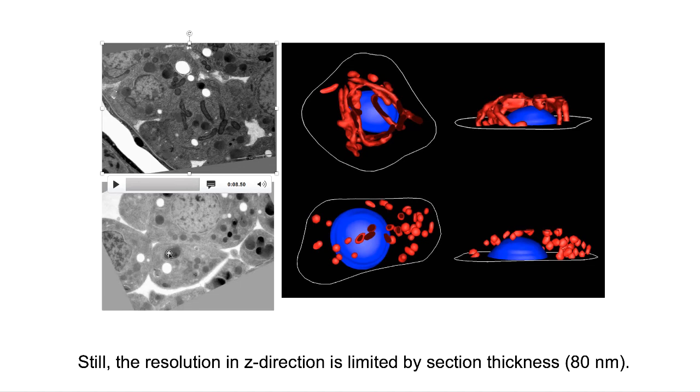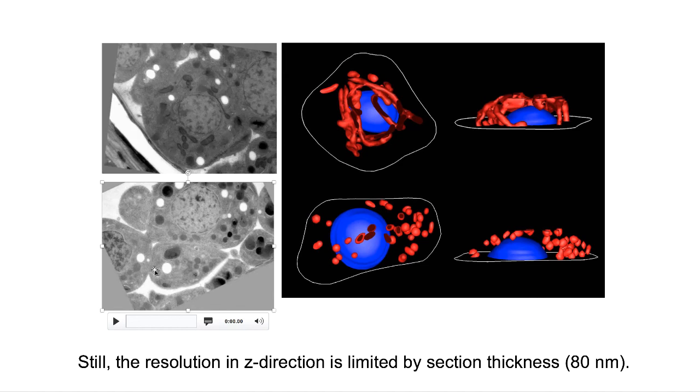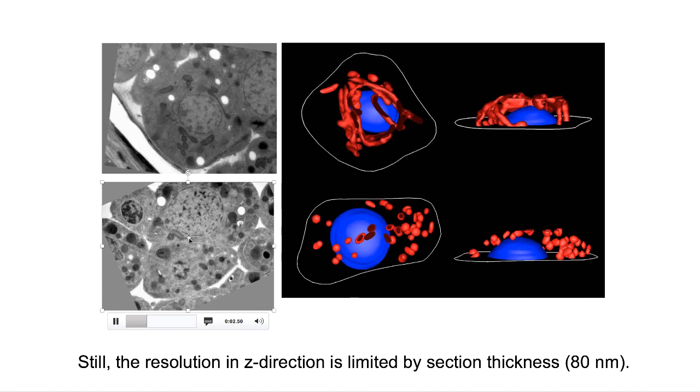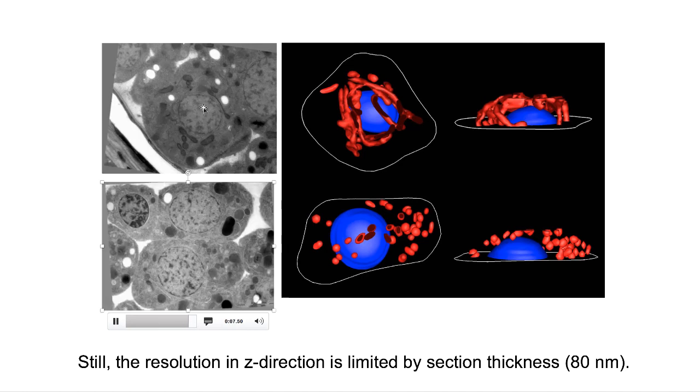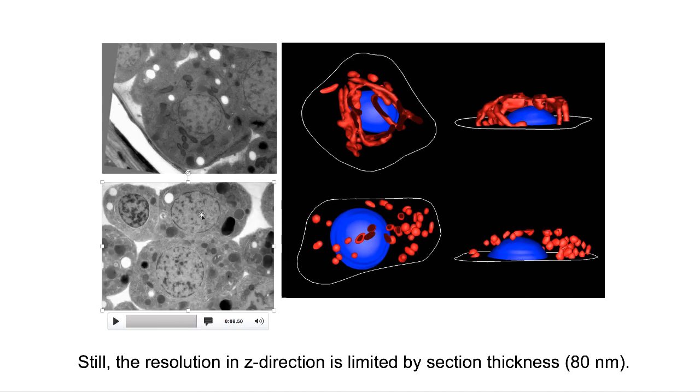elegans cell. And this is a mutant where mitochondrial fusion is inhibited in this cell. The mitochondria look more round, although there are some sausage-shaped ones. When compared with this cell, the mitochondrial organization is very different. So the mitochondria were outlined in red color and shown here as individual bubbles. And then by showing this in multiple orientations, we can easily compare mitochondrial organization in these cells.